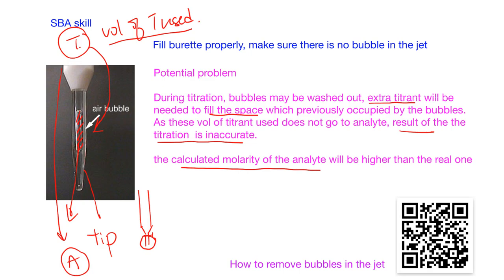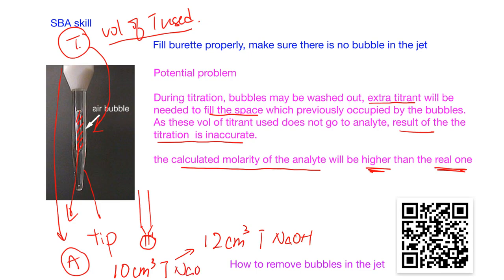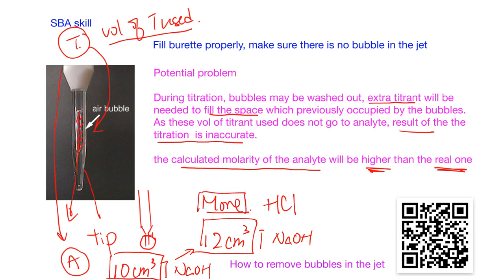So the results of the titration will be inaccurate — specifically, the calculated molarity of the analyte will be higher than the real one. For example, you may only need 10 cm³ of titrant to neutralize the analyte, but because some titrant fills the air bubble, it may appear that 12 cm³ of NaOH was needed. This makes it seem like there is more acid (HCl) in the analyte than there actually is. That's why we should not have any air bubbles in the jet.